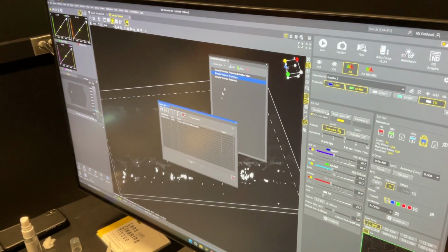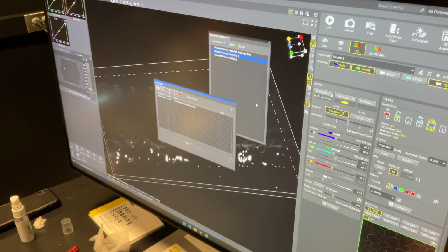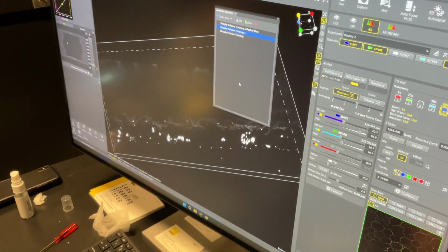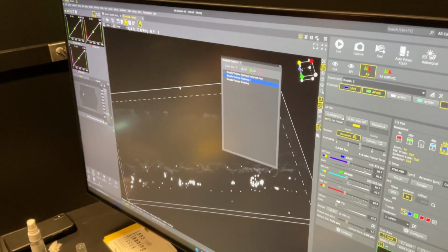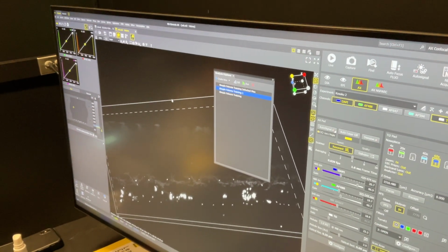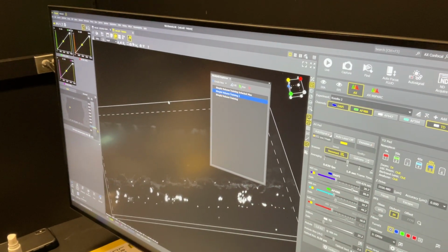We got a little baby fluorescent light microscope a little closer to our lab, so is this software available on different desktops? You can install it anywhere, but you need the security key, a license key, to run the software. We'd have to check to see if ours has one. You can also get analysis-only licenses.